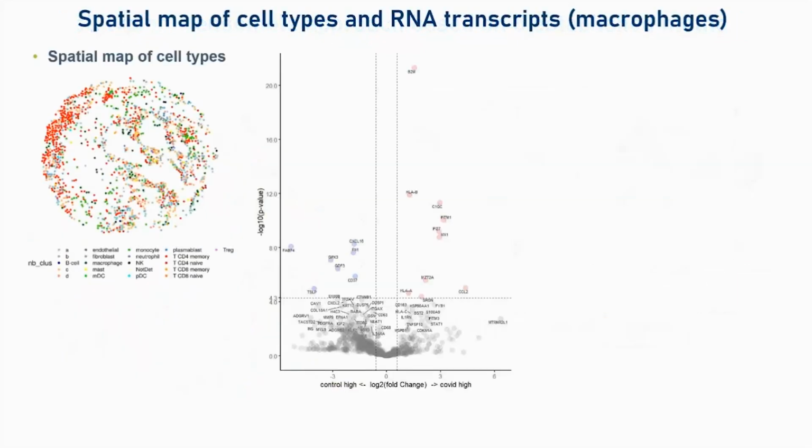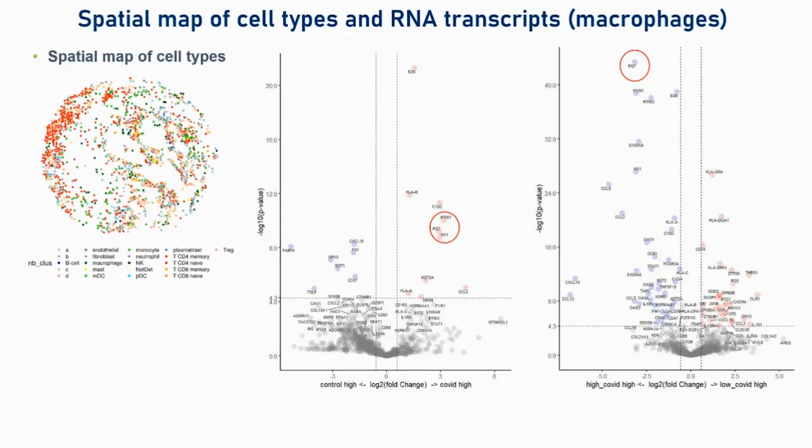And so when we contrasted control versus COVID, we could see that IFI27 was one of the top differentially expressed genes, specifically enriched for in the macrophages. And this was again evident to us in viral high versus viral low when we incorporated the RNA scope readout and used this as a pixel measurement across it. So we could localize that IFI27 signal using a multicellular approach, and then we could drill down into the cell type and identify in the macrophages where the signal was coming from.